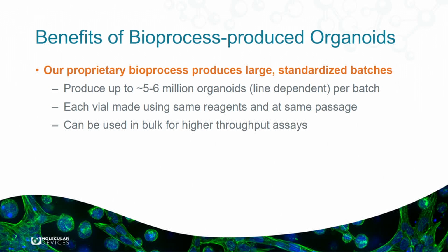We're at the moment working on our second generation bioprocess, which will be able to generate probably 4 to 5 times that amount. So these are very large batches, which really enable organoids in high throughput screening applications.